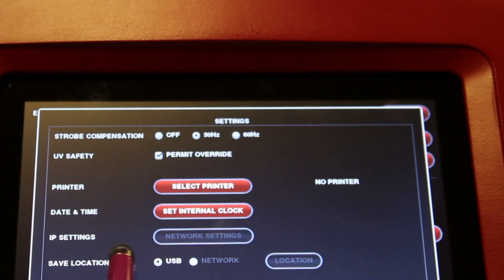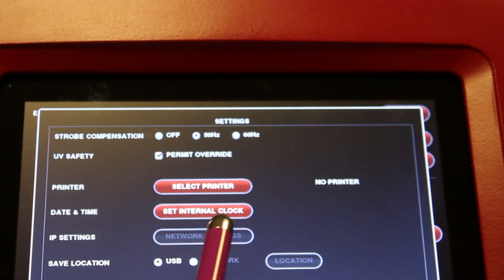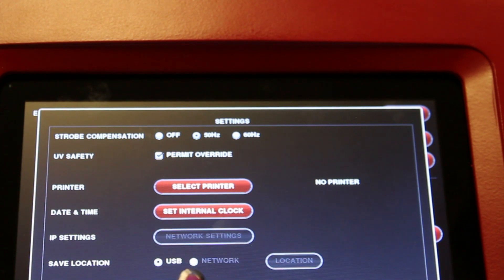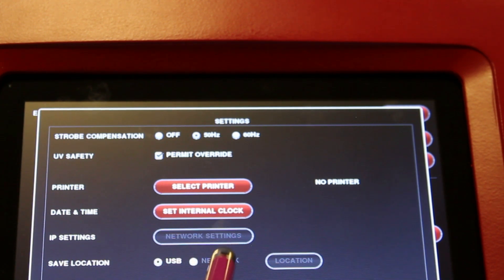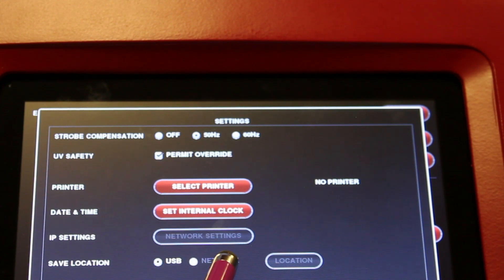You can also purchase a network dongle to connect your Neugenius system to the network. You can choose which location to save your files. You can either save by USB or, if you have a network connection, by network.